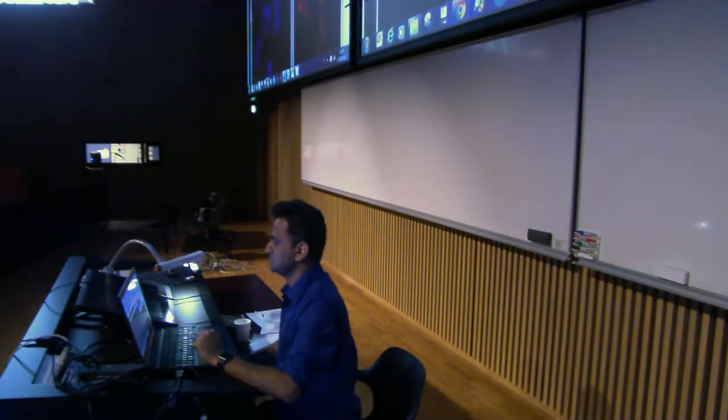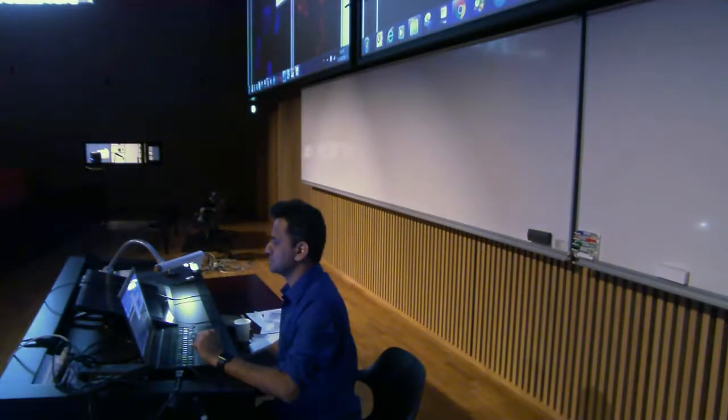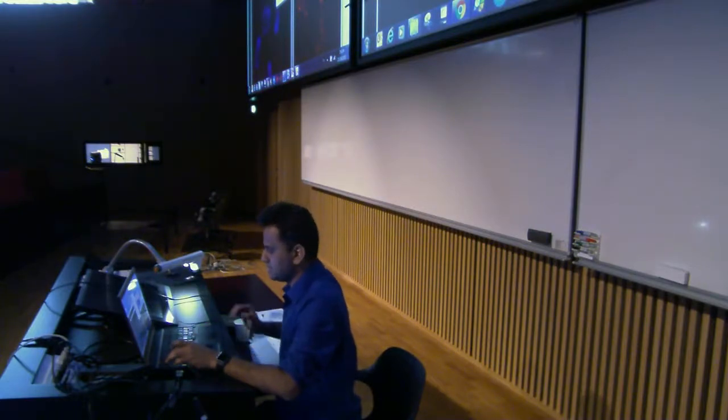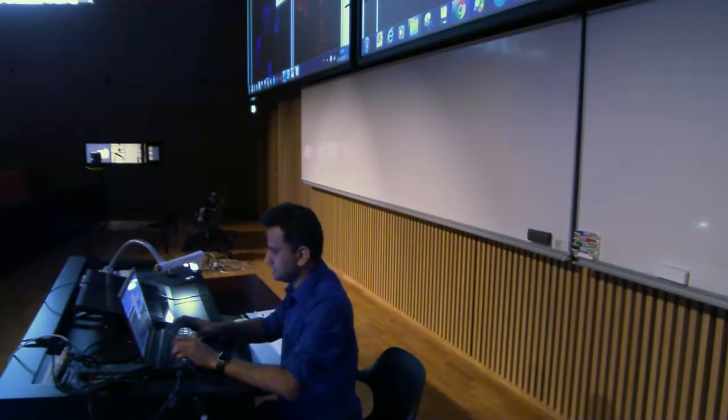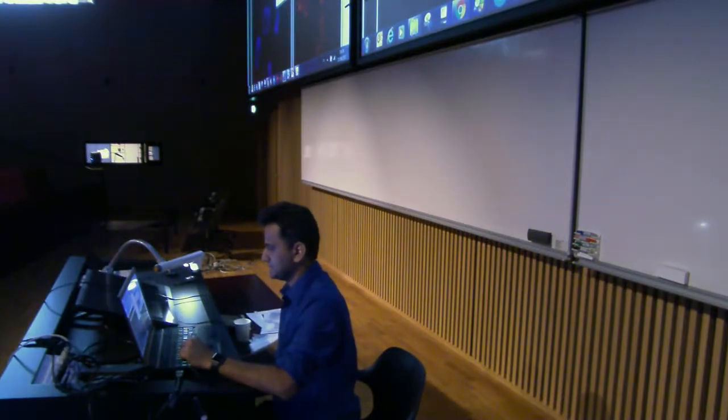Now you just go to Image, Stack, and make a montage, and you can give different columns and rows, however you want to display. You can put the scale bar as 0.5 or whatever scale bar you are interested in, maybe 1, and then that's it.